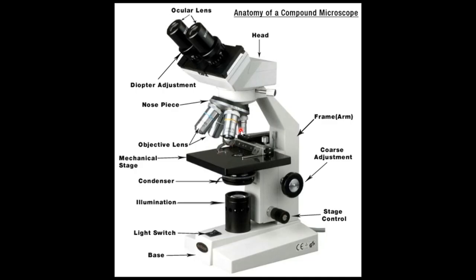Now, when you go to use a microscope in real life, always, always, always use the low power lens first. The way microscopes work is that they're really easy to use at low power. It's easy to find your object, it's easy to get it in focus. It's just not as high magnification, and the higher magnification you use, the more difficult the instrument is to use. It's more difficult to focus, it's more difficult to find your object, it's more difficult to everything.